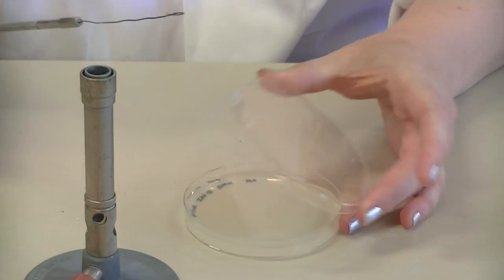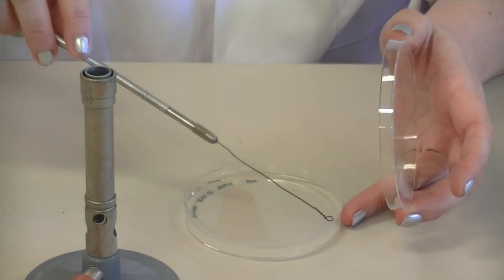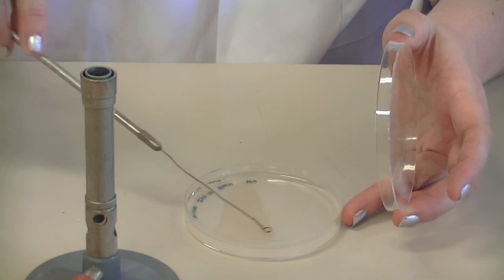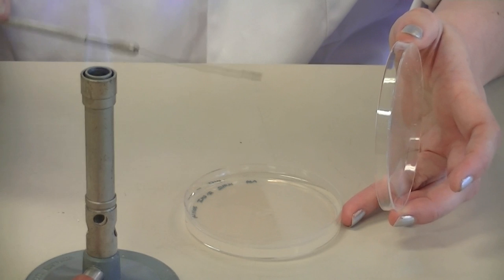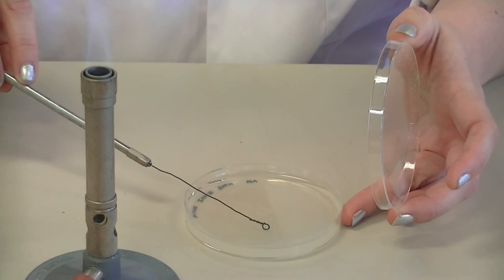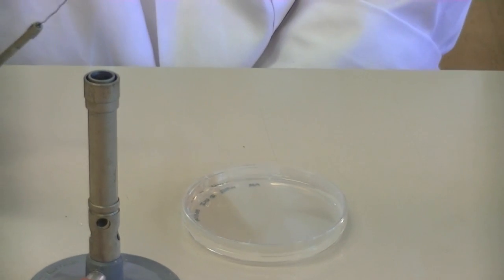I've turned the plate. I'm going to check that my loop is cool and then intersect the tertiary lines with the quaternary lines. Then I'm going to flip the loop upside down, drag a vertical line through those lines, and then a zigzag into the middle of the plate so that I get my single isolated colonies.